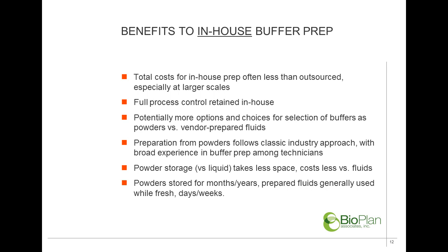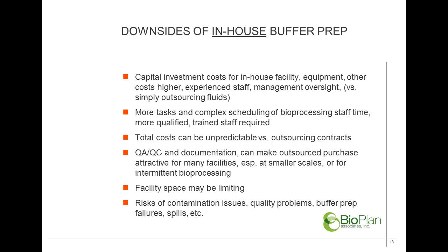Many of the buffer prep technicians are really good at it, and many consider there's no reason to change. Powder storage versus liquid, of course, takes up less space. The costs are less versus fluid storage, and powders can be stored for a long time versus when you have a freshly prepared fluid, then that has a shelf life.